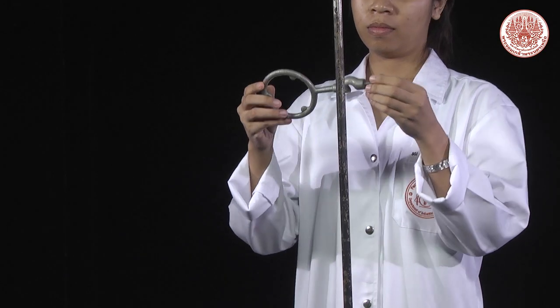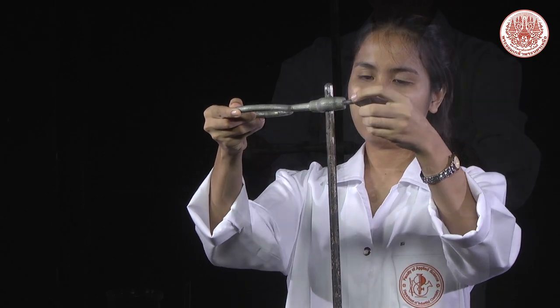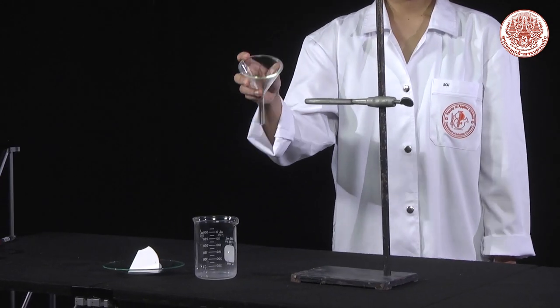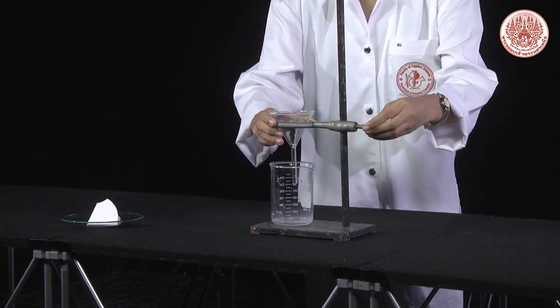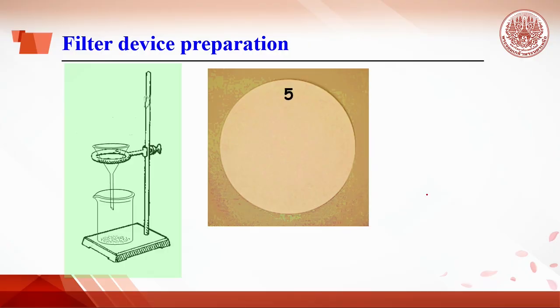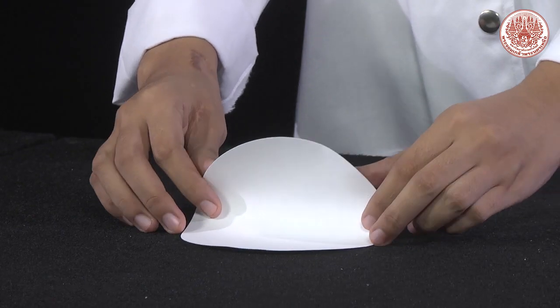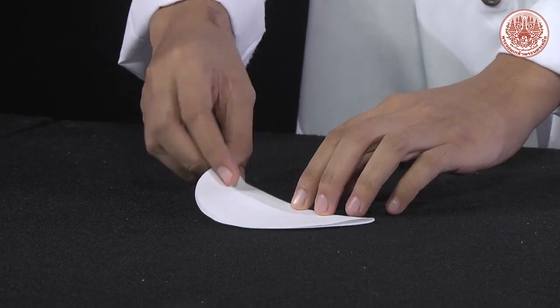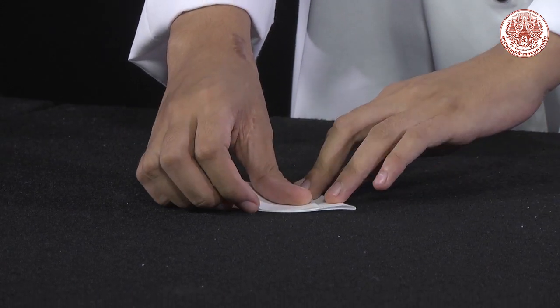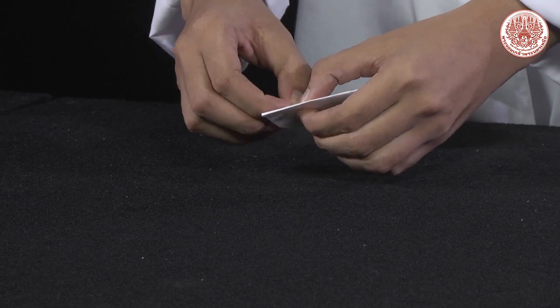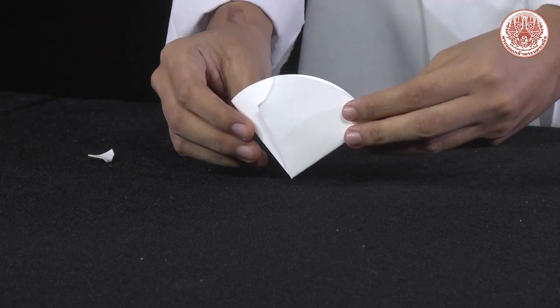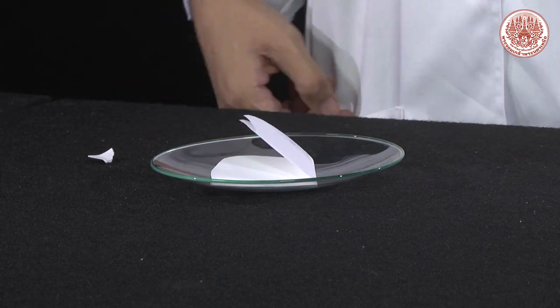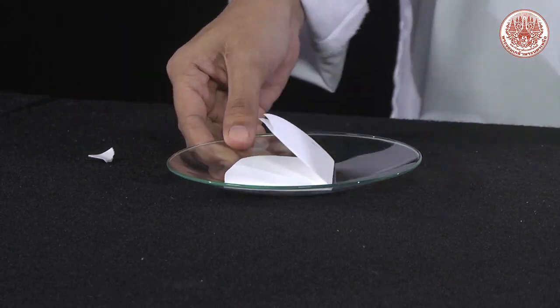During waiting, filtration devices are prepared, including stand, ring, glass funnel, beaker, and filter paper. Write the group number using a pencil on the edge of the filter paper and fold exactly in half. Then fold a second time with a slight offset. Tear the corner from the smaller side of the filter paper. Place the ready filter paper on the watch glass and record the weight.